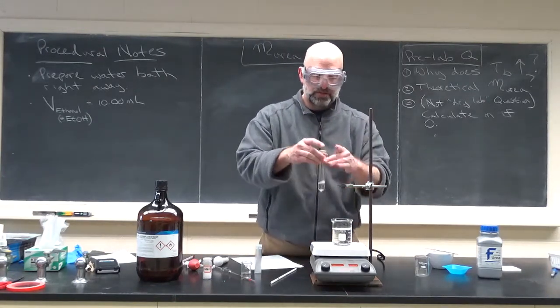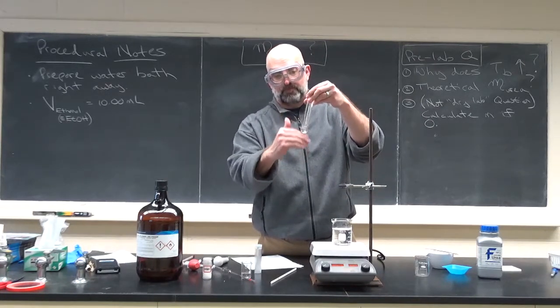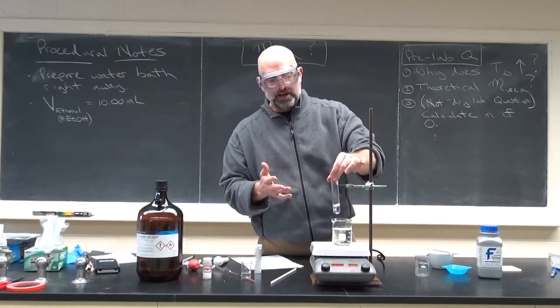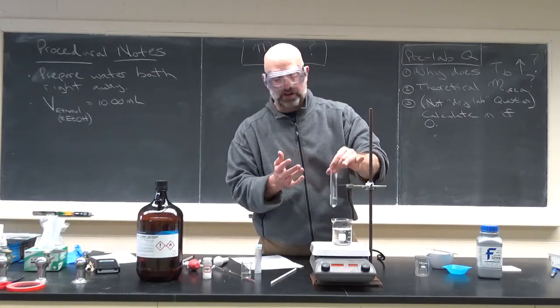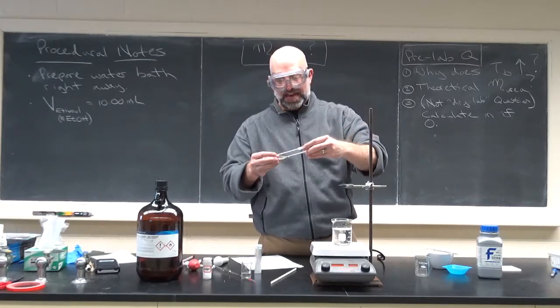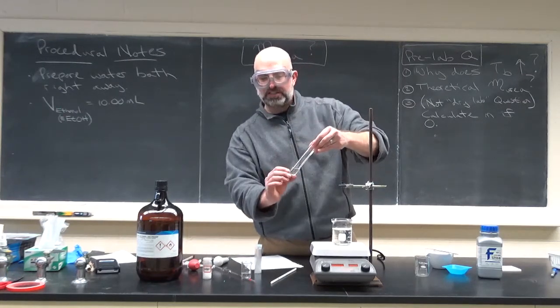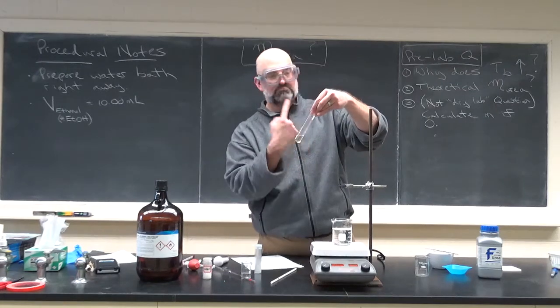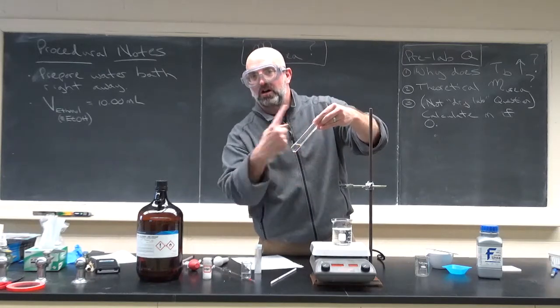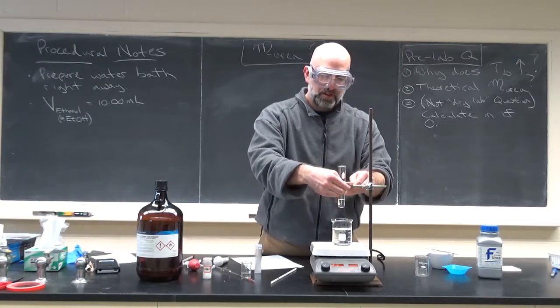And then, if you need to, you can hold it at the top and tap it, because it actually swirls the liquid in there. It takes a little bit to dissolve. It will dissolve very, very quickly when you put it in the warm water. If it gets caked all over the side, like, I don't know, you had too much coffee or something, you can take the ethanol and make sure it all goes down. You don't want any solid on the sides. That would be a source of error. Actually, I may have caused a source of error by getting ethanol all over the sides. Okay. So there are some sources of error here. So the point, I'm not going to show all.